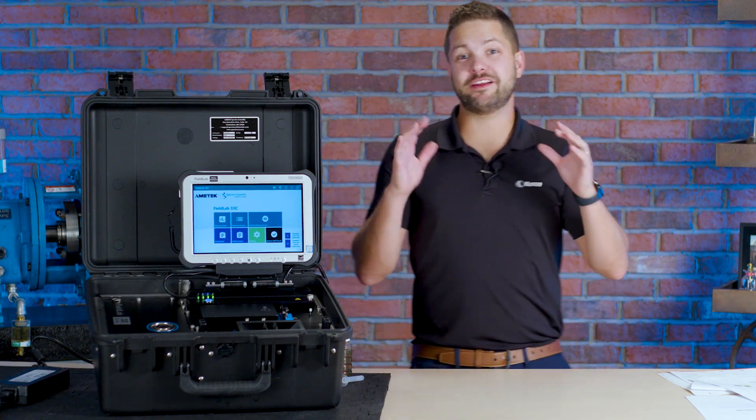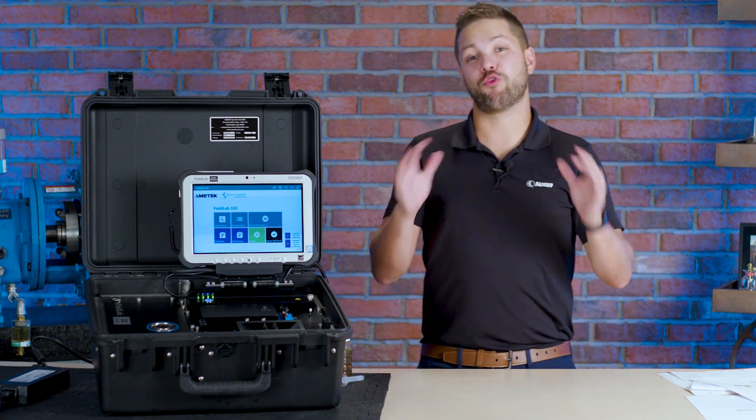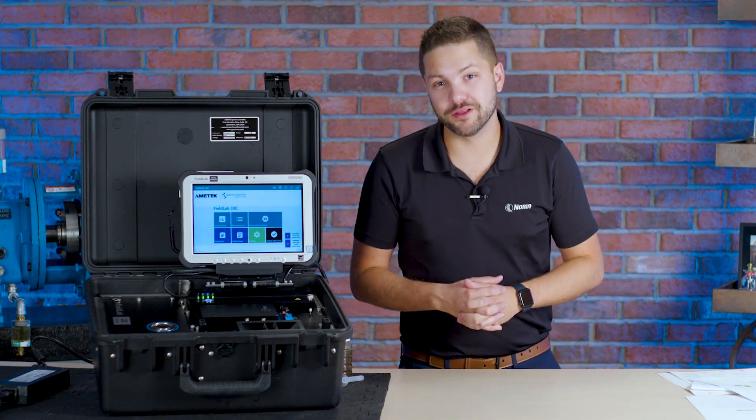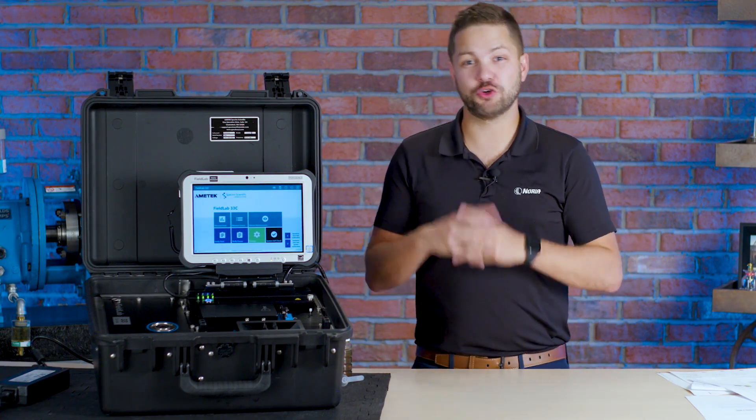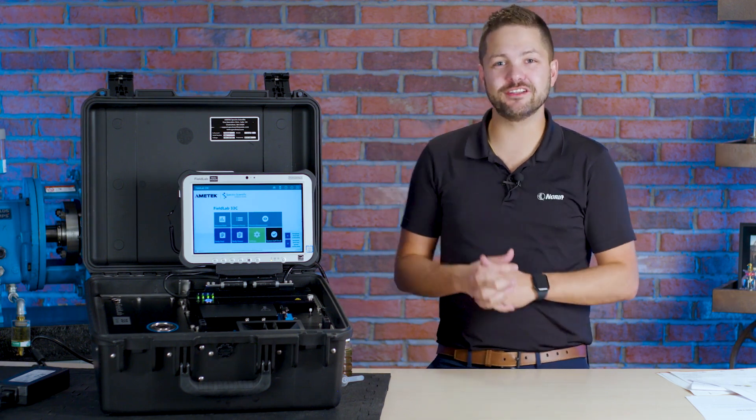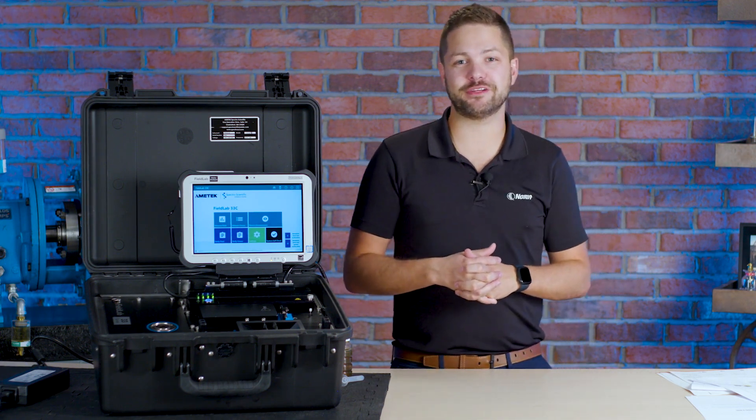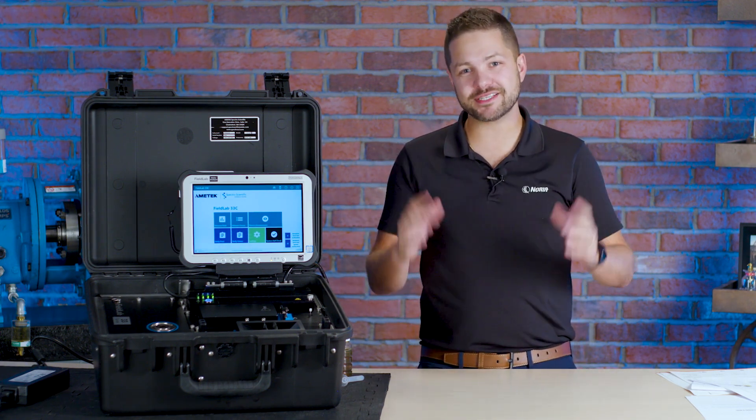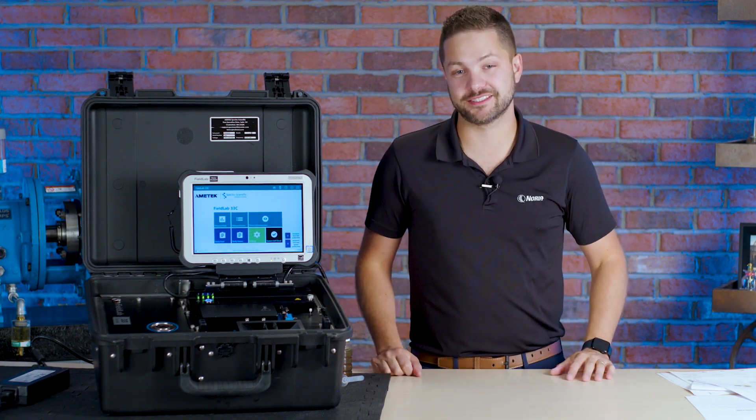Okay today guys I want to introduce you to a brand new oil analysis tool. This is the Fieldlab 33C by Ametek Spectra Scientific.